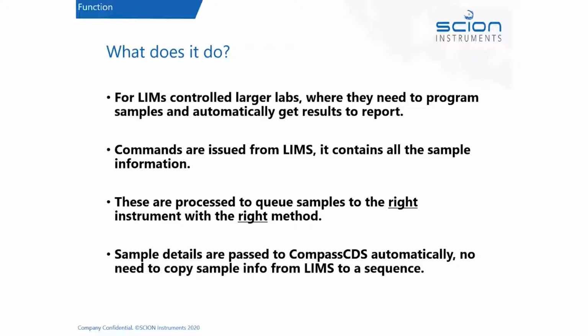Using Sample Streamer, instead of transferring that detail from the LIMS system to the CDS system, which is what most of us are doing just now, it's typed into LIMS, and then a bit later on you type the same information into CDS. With Sample Streamer, you create a direct connection between the LIMS system and the CDS. The LIMS system picks up the name, you determine what tests there are, and the LIMS sends that to the CDS system to actually run the samples and provide the sample lists, if you like, on the CDS.